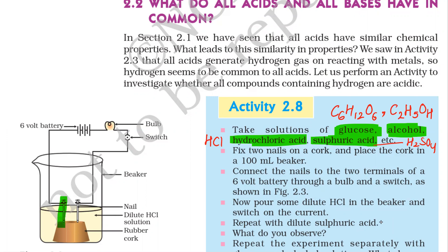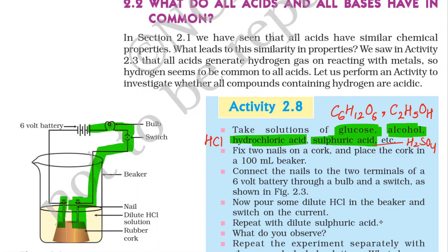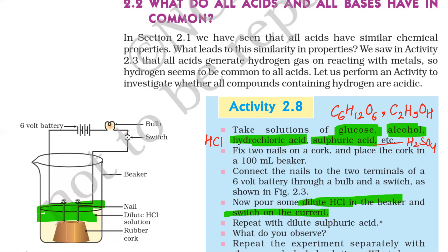So these are the two nails, and here a six-volt battery is connected, a bulb is connected, a switch is there, and it is connected again to another nail. Now pour some dilute HCl in the beaker and switch on the current. This beaker is filled with dilute HCl.